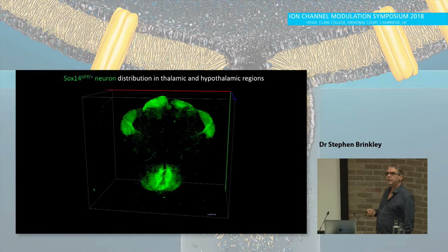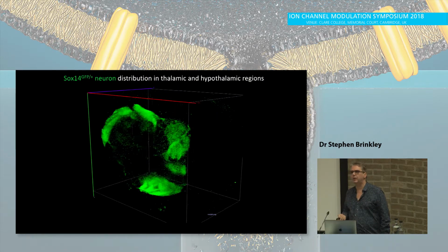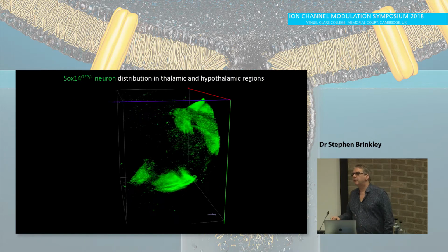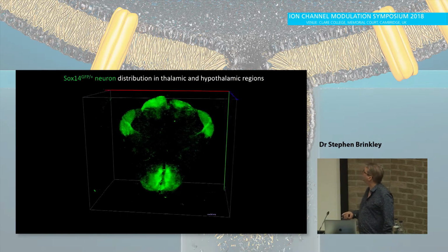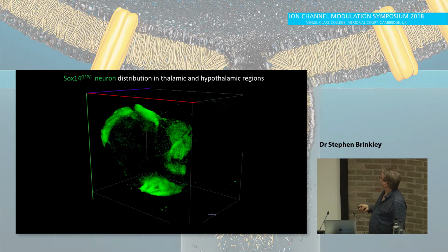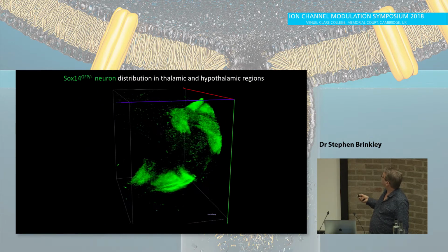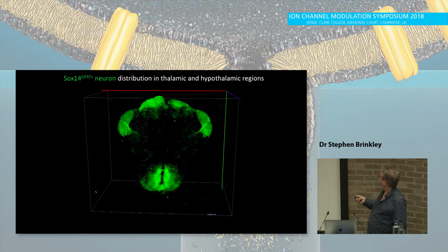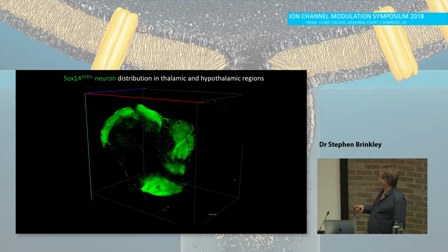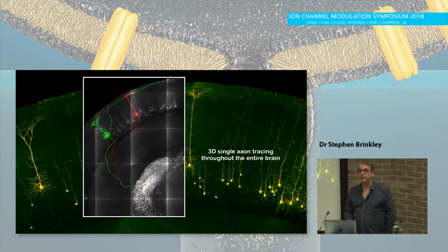That was actually autofluorescence. More powerfully, you can look at single cell populations, and this is a SOX14 promoter driving GFP. You can't use antibodies for this. You've got to have an intrinsic fluorescence within the brain to look at, because you've got a whole brain blocked there. But I show this because these neurons are expressed in the thalamus, the visual thalamus, the intergeniculate, the dorsal and the ventral LGN, in the inferior and the superior colliculus there, and also in these hypothalamic regions down there.